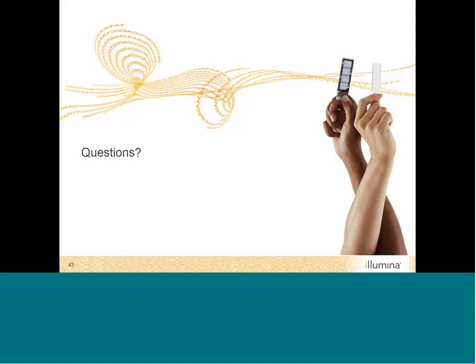Okay, another question, is there a suggested tutorial to learn more about BAM files? Yeah, IGV is a great solution to go and play a little bit with the BAM file and look at different metrics. It is a third party tool, so we want to look at the Broad website to find potential tutorials, but that's where I would start. Okay, great, thank you.